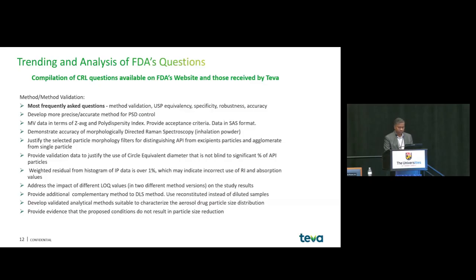I think that is kind of common. We have seen it repeated. Explanation requested for using 10 inhalation batches in APSD studies and why LOQ value is considered sufficiently low enough.